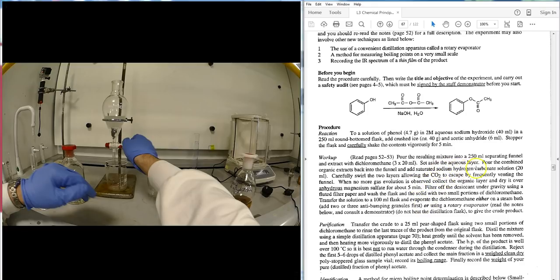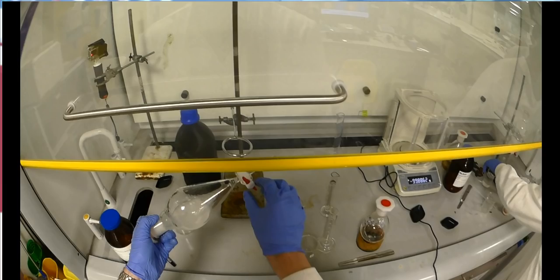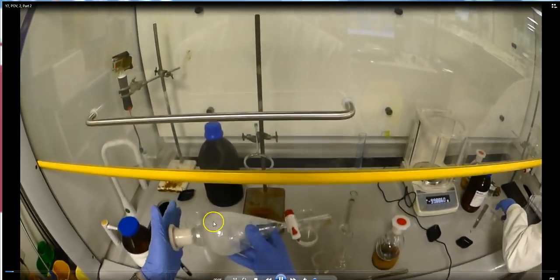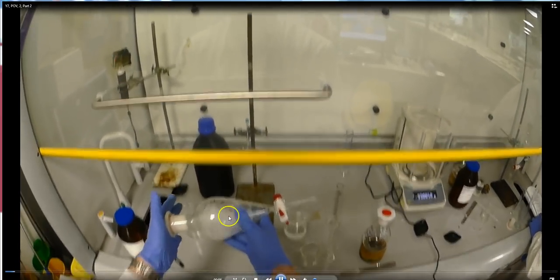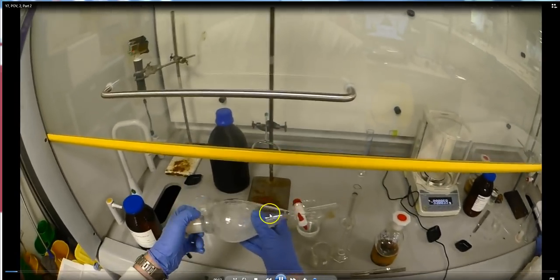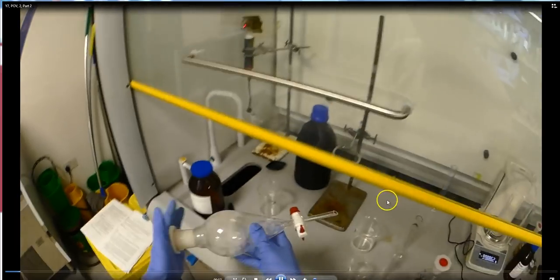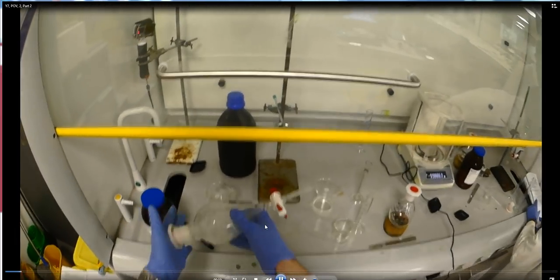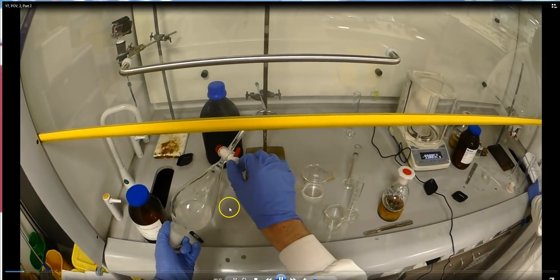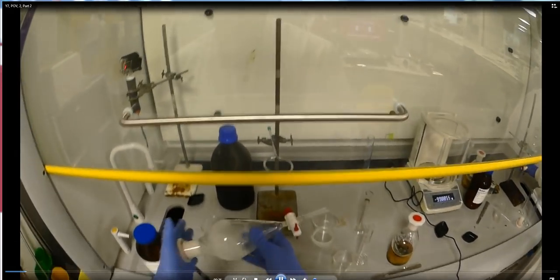Moving forward, the student now has the sodium hydrogen carbonate and the three lots of 20 mL DCM combined in the separatory funnel, swirling and venting. This wash will produce CO2 gas, so you'll hear hissing. The student keeps a hand on the stopper while swirling, and vents carefully.